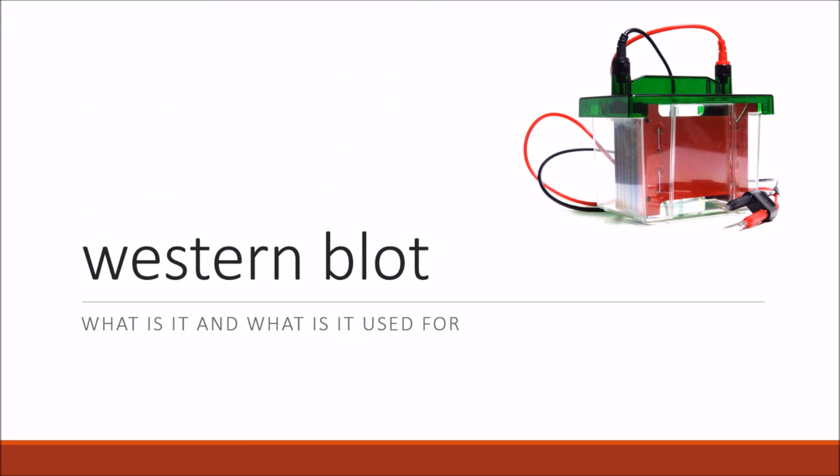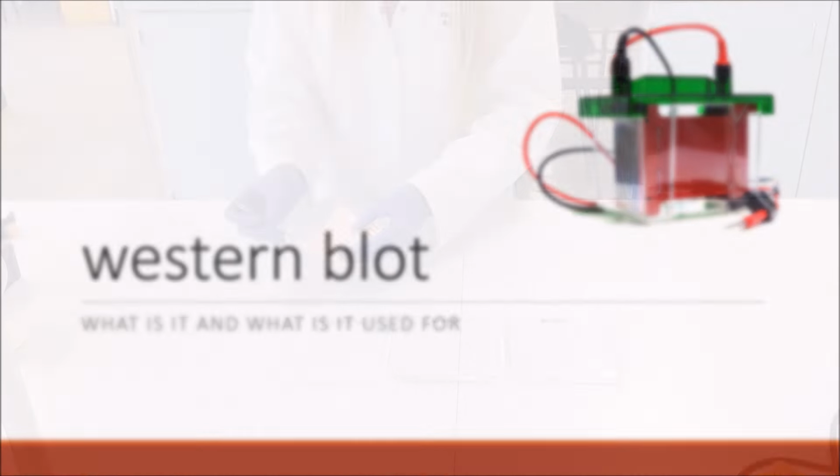During this short introductory video on the Western blot, I have covered what it is and what it's used for. I'm now going to continue on and show you the entire experimental procedure for the Western blot.